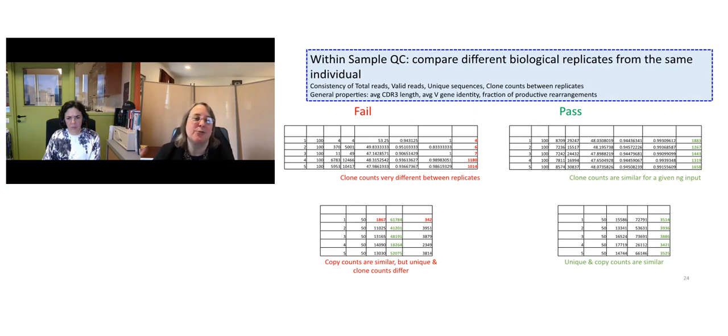especially if the controls in our run, such as positive controls like running a spleen sample or a PBMC, a leukapheresis collection as a sequencing run control, don't work. That's not a good situation, and we probably want to rerun the entire batch of samples. But with this situation where we have a single replicate that failed, but other replicates that worked, another strategy is, of course, to take the bad replicate out of the data and exclude it right at the beginning, because it has failed to pass our criteria for an adequate number of clones.